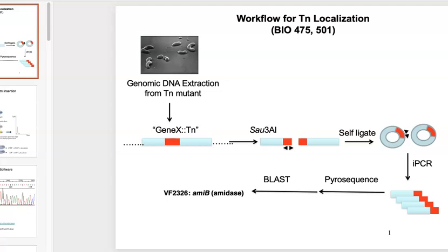This lecture is a brief overview of bioinformatics, some of the software and databases we'll be using in the lab portion of the class. What you see here is a workflow for transposon localization.